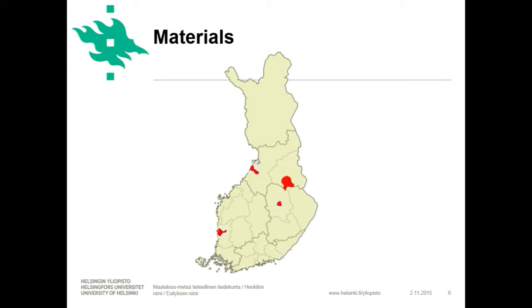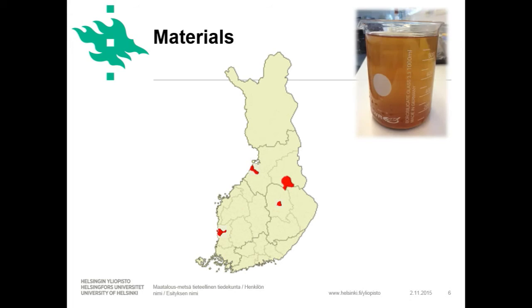Now let's review our materials. The wastewater we studied comes from Talvivaara mine, Sotkamo, Finland, with pH of around 3, very condensed and cloudy, with lots of suspended particles, including heavy metals and sulfur. Then we had 3 geomaterials, all byproducts of Finnish industries.